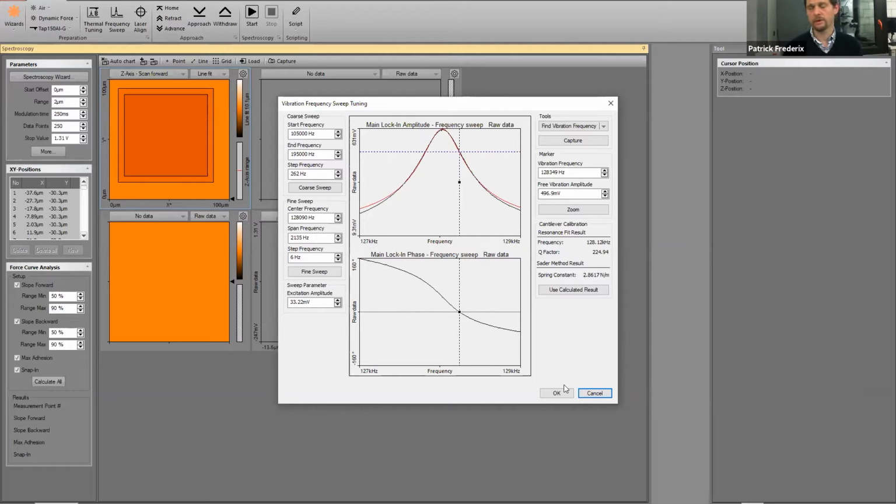What I do like about the FlexAFM approach is that you can get rid of a contaminated bead without exchanging the cantilever. Or if you have different sized beads, you can first do one size, then another size. Or you can have different types of coatings on your beads if you want to study adhesion. So there you are more flexible with those experiments.